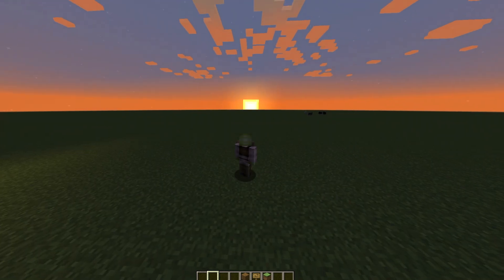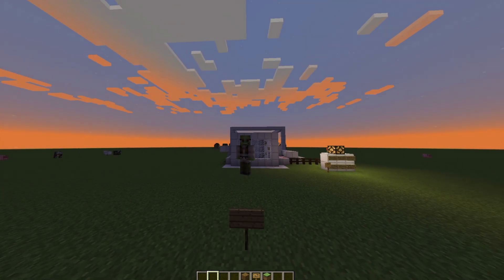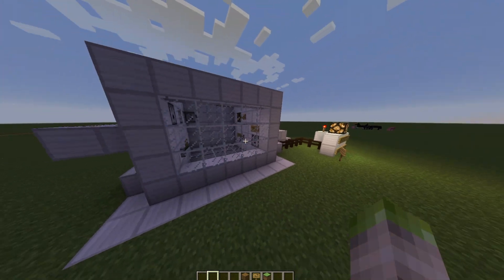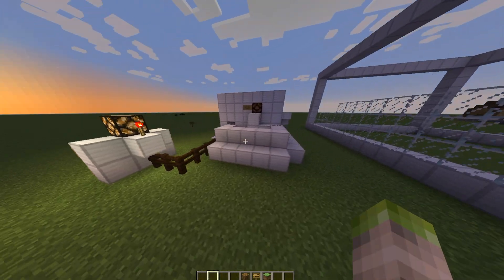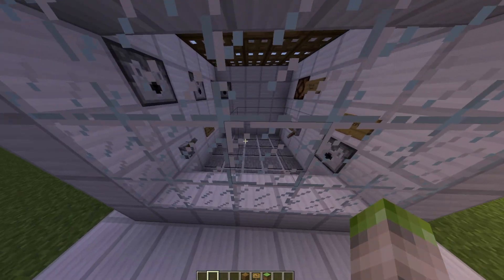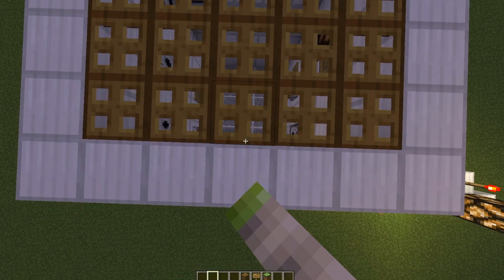This is Eddie and Robbie's operant chamber. Let's go ahead and take a look at what we got here. This is the entire structure right here — let's do a 360 view. Alright, ignore that little structure to the right, it's a failed attempt — prototype one. This is prototype two. Let's go inside the Skinner box, or the operant chamber.